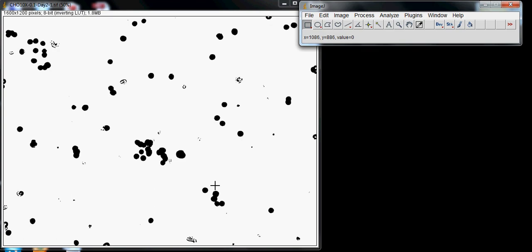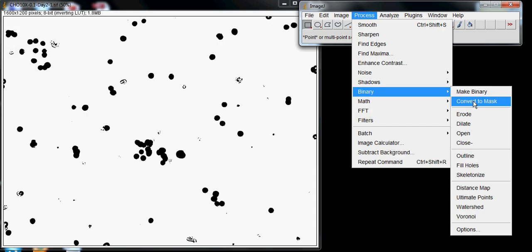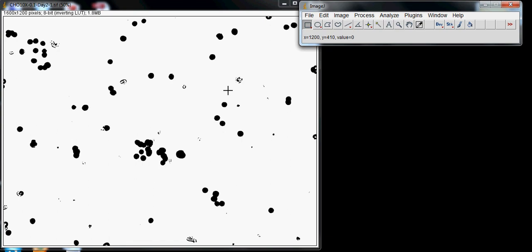How does that help? Well, these are still smushed together, so there's another step. Go to Process, Binary, and Convert to Mask. This converts it to a different type of image that allows us to do additional processing.